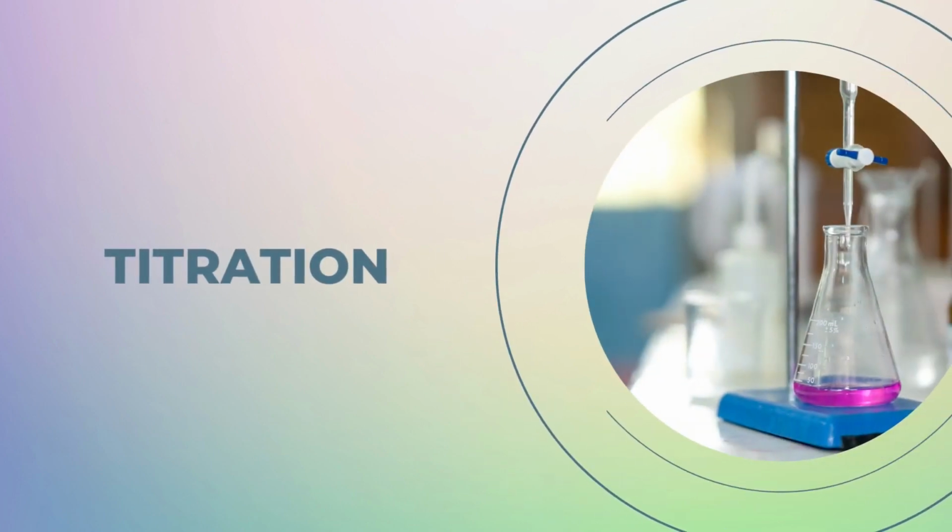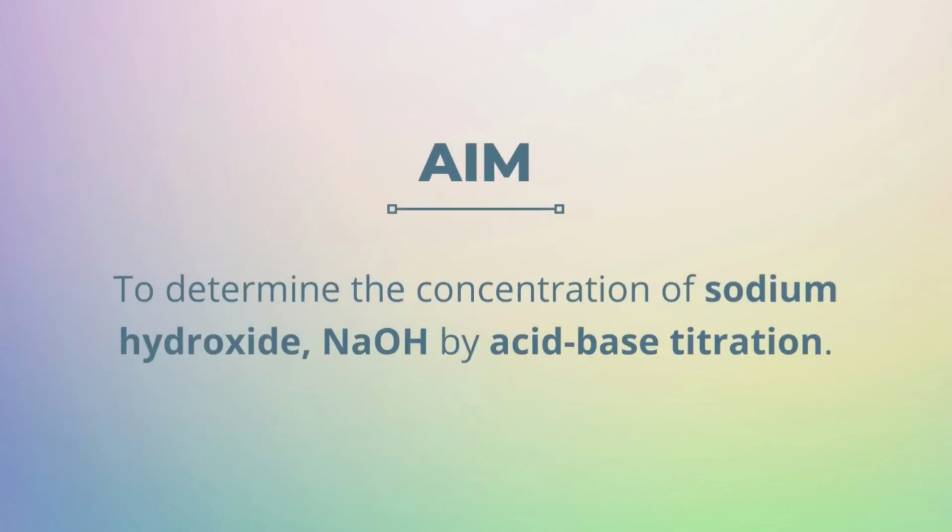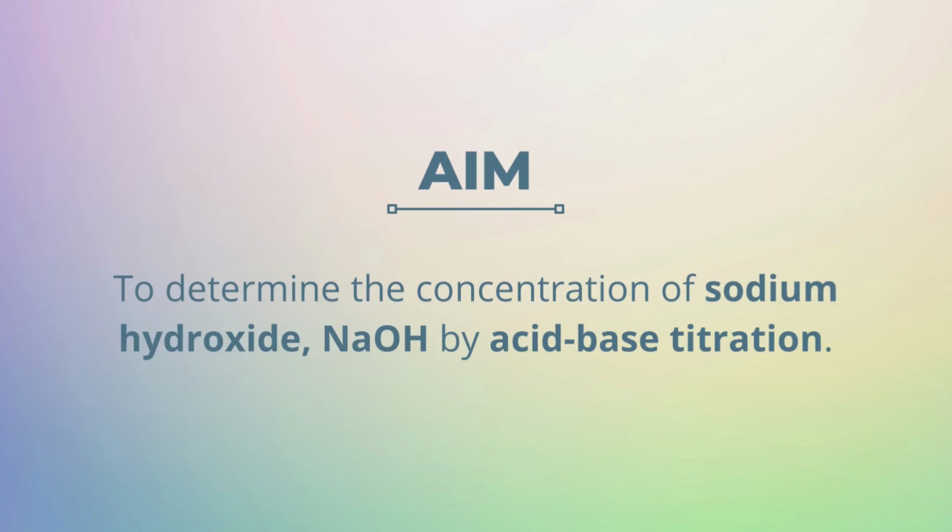In this video, we're going to be learning about titration. The aim of this experiment is to determine the concentration of sodium hydroxide, NaOH, by acid-base titration.